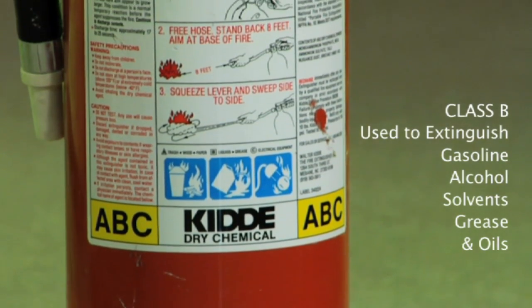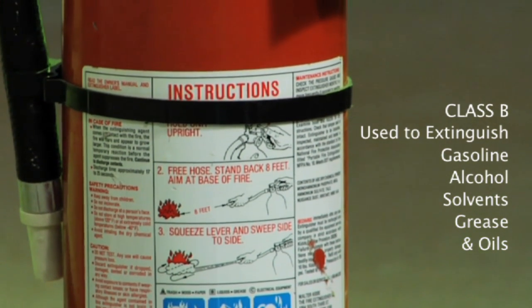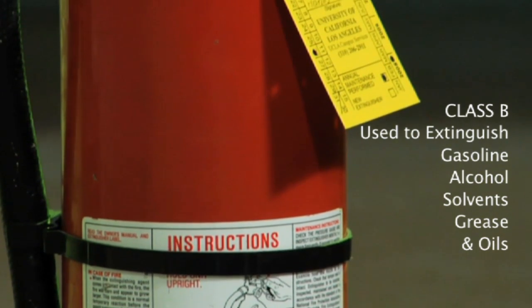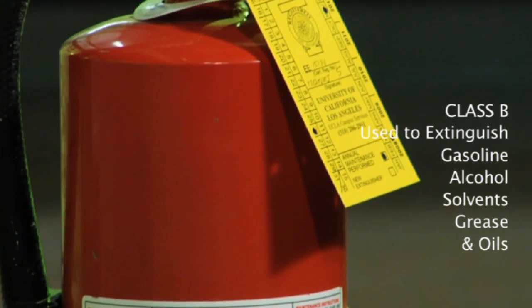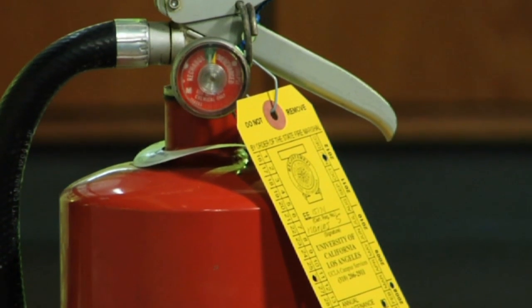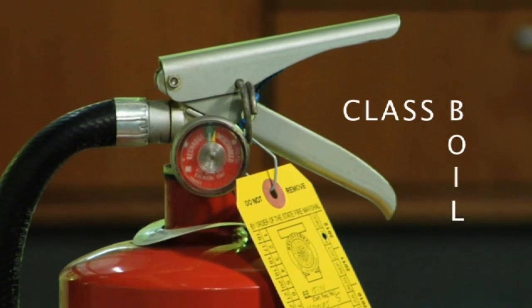Class B fire extinguishers are used to extinguish fires involving flammable liquids or gases, such as gasoline, alcohol, solvents, grease, and oils. Gases such as acetylene, methane, and hydrogen would also produce Class B fires. Some people find it helpful to remember that Class B fires can boil.